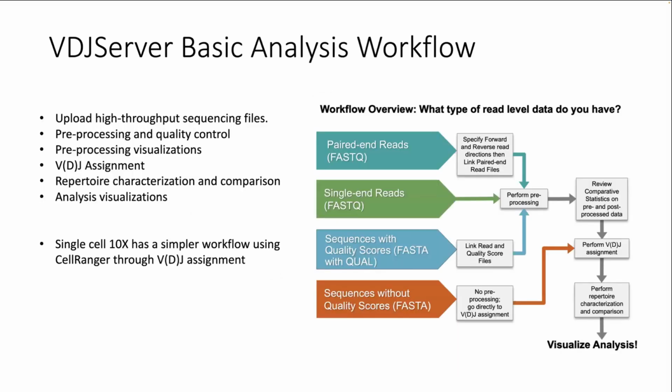So as I said, VDJServer provides a number of analysis workflows. Now, our approach has been to provide mostly a single standard workflow. So that has advantages and disadvantages, right? If you need to do something custom, you might have to work on your own workflow for that. But for the most part, the standard one works for a lot of people. And then you can get the output and do some additional stuff. So there's a rough aspect of what the input files are.